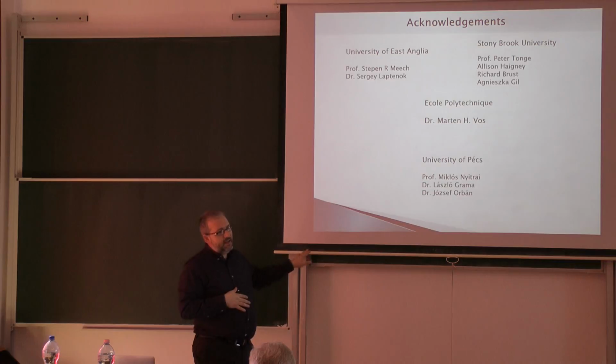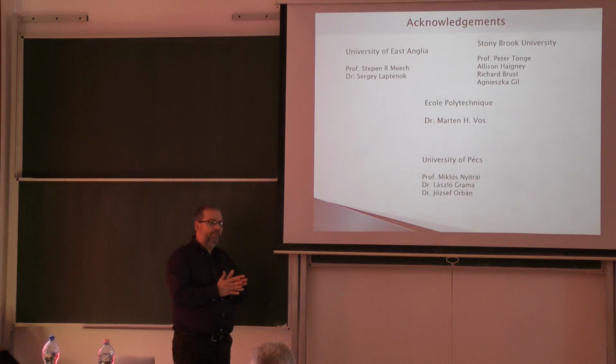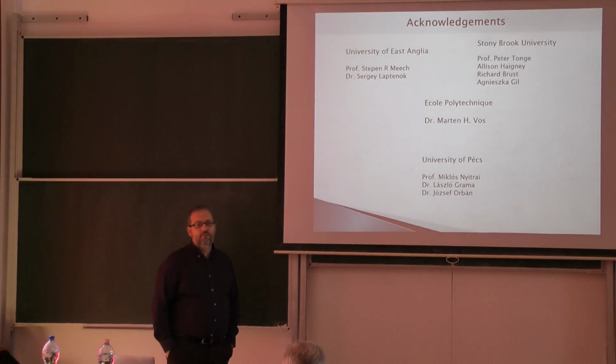The oscillator itself, in the beginning, is 100 megahertz. It works at that repetition rate, but of course it's divided down. And what we do, even in our lab, is that we have a 2-photon microscope, and almost 50% of the beam goes in that 2-photon microscope. But the rest goes in the amplifier, and that goes with 1 to 5 kilohertz. Basically, this is what our system works at.